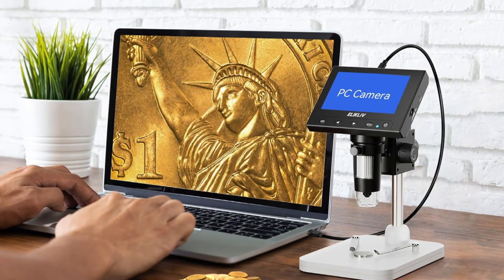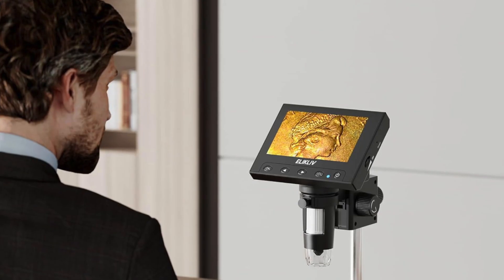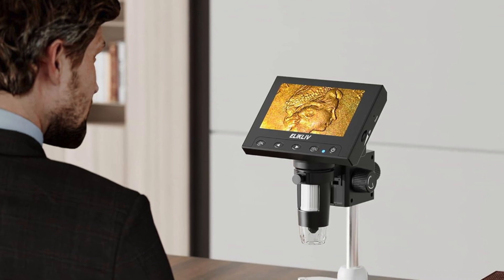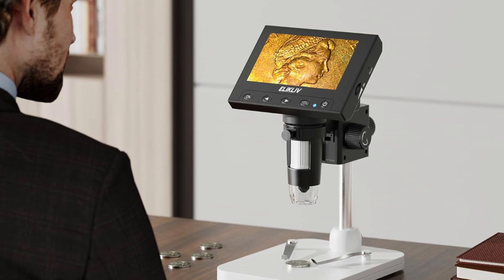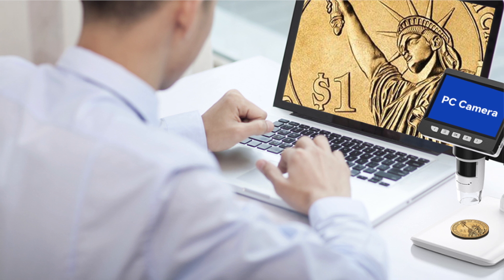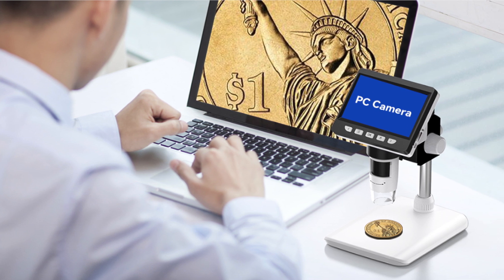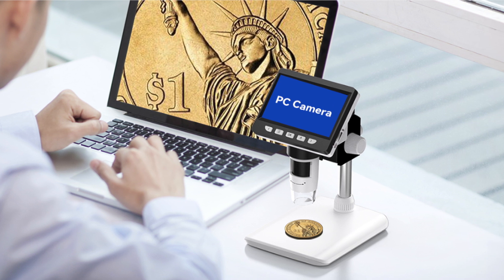This microscope is compatible with Windows and Mac computers, enabling users to view objects on a larger screen and save images for further analysis. A height-adjustable stand provides flexibility, allowing precise focusing for different magnification needs. Designed for convenience, it includes a built-in rechargeable battery that offers up to three hours of continuous use, making it ideal for portable exploration. It supports photo and video recording with an optional memory card.